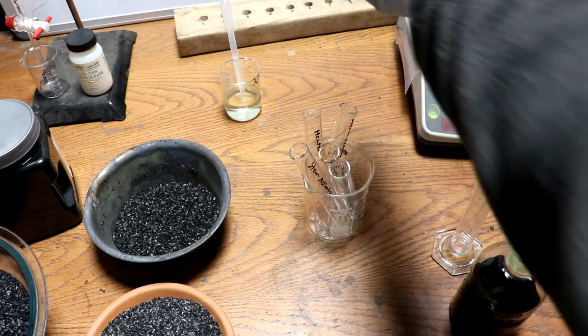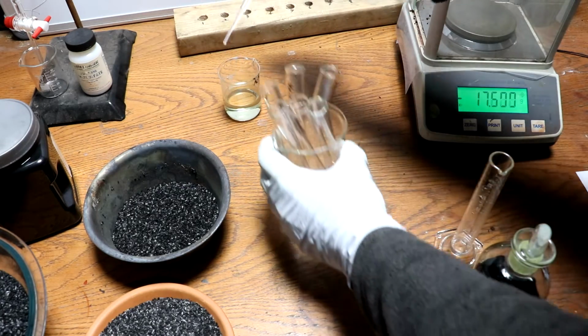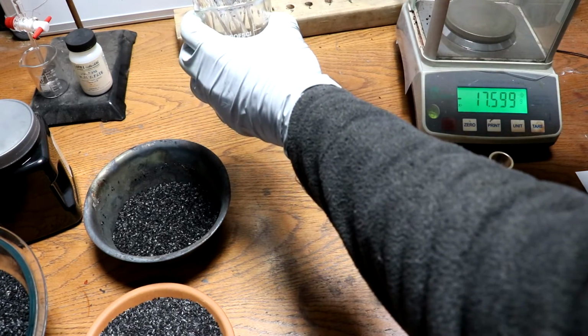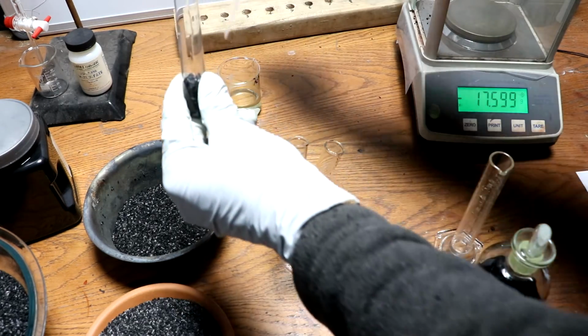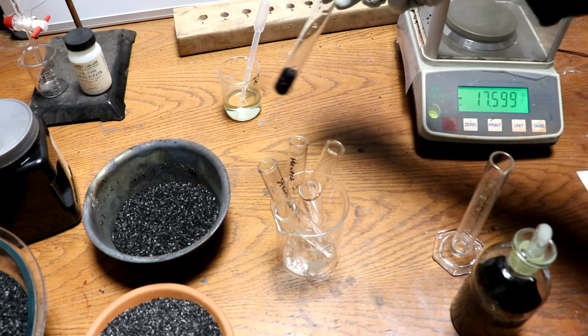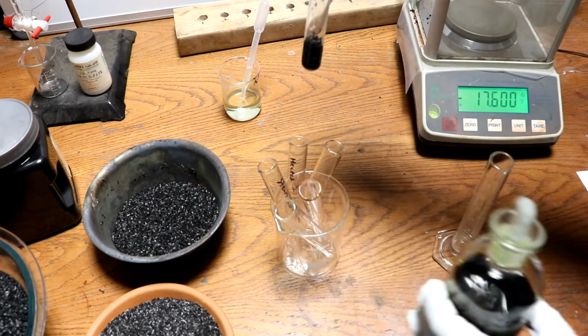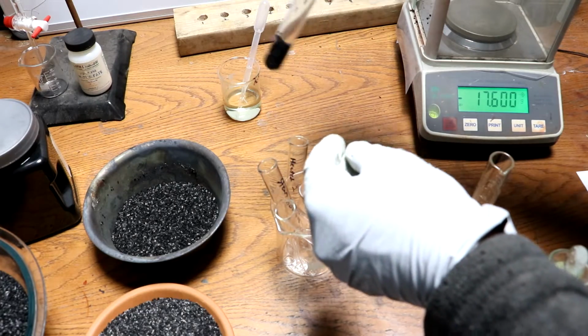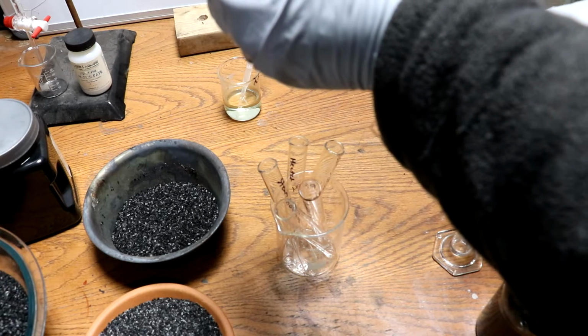Okay, so now that I've got a gram of the charcoal in the test tube, I'm going to add some hydrochloric acid, approximately 2 milliliters worth, to make sure that the charcoal is acidified, because the alkaline ash in the charcoal will react with the iodine. Let me get this acidified. I might even warm it up with a torch a little bit just to make sure it reacts.